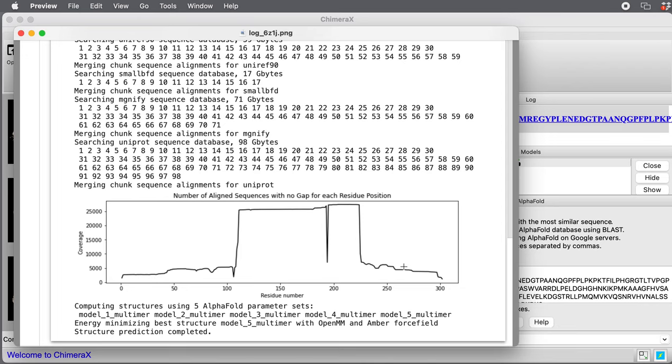You want to see it find at least say 100 sequences. If it's less than 100, then the quality of the structure prediction is going to be impaired. It uses the multiple sequence alignment to look at how different amino acids co-vary mutations that occur, which tells it where contacts between different residues occur.